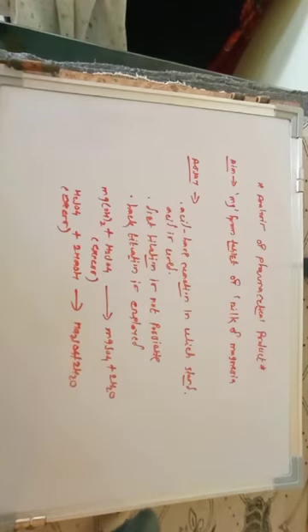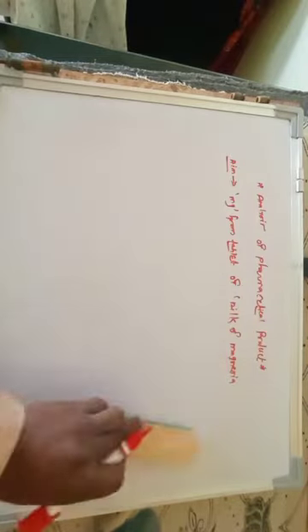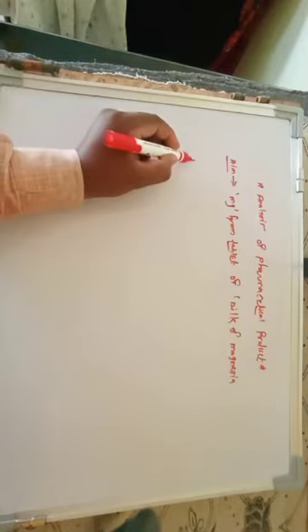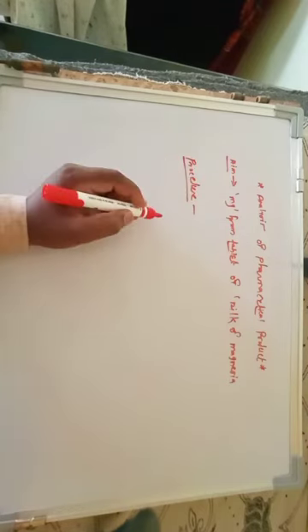So let us discuss the procedure for this titration. The procedure is very simple.